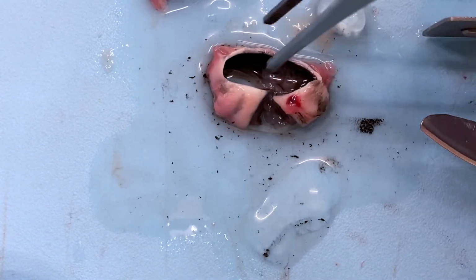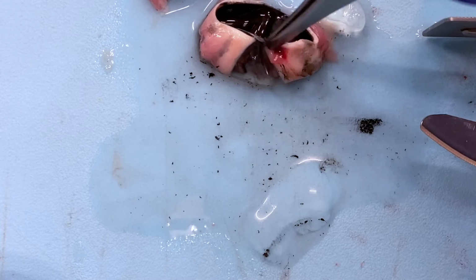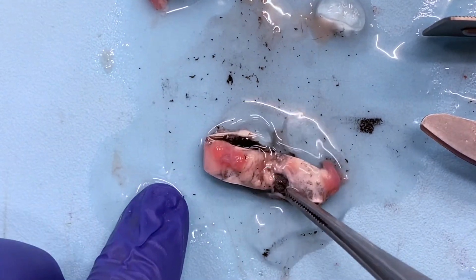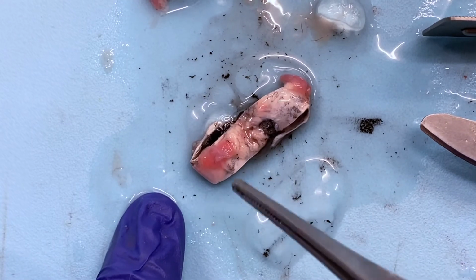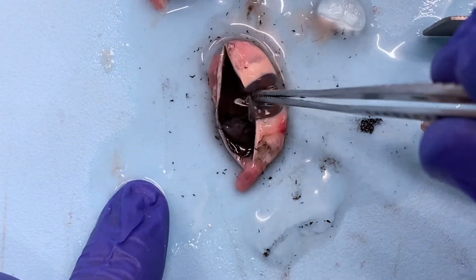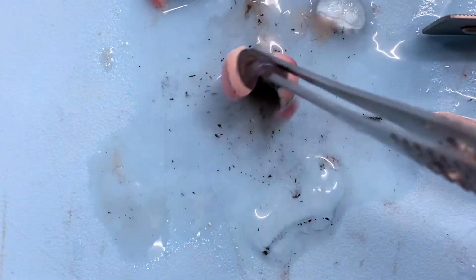So this is kind of the primordial pupil to optic nerve section. I've got to make sure I have my optic nerve on there, which I do. You can see that right there. And I want to make sure I have my pupil on there, which I do, right there. Okay, so I'm going to go ahead and get this cleaned up, and then we'll come back and work on that section a little bit more.